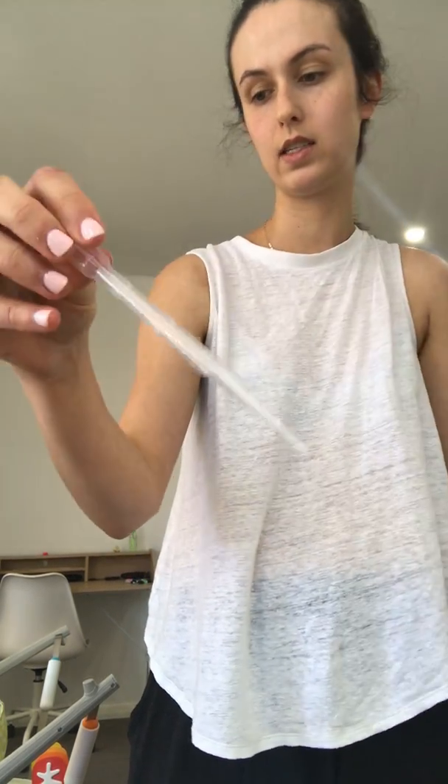Optional is this transfer pipette. You can use any kind of syringe, but this is just really handy especially for this kind of activity that we're doing.